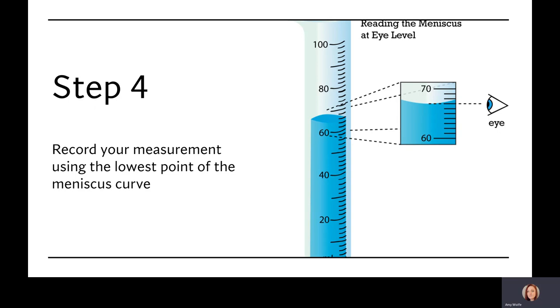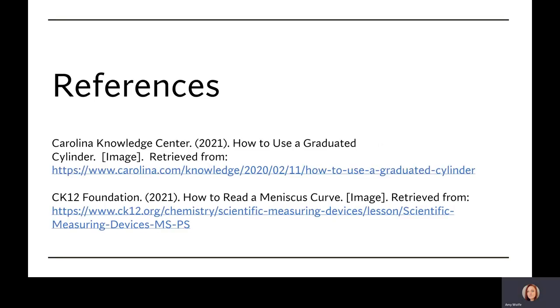Locate the closest whole measurement below the surface of the liquid, then count the number of segments up to the line nearest the meniscus. Make sure you record your measurement at the lowest point of the meniscus curve. Congratulations, you have successfully measured using a graduated cylinder.